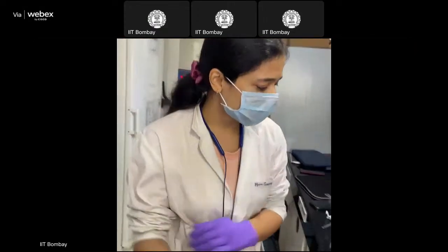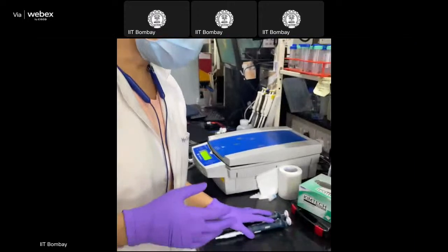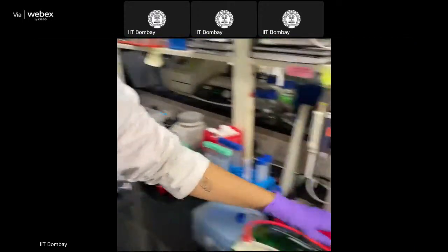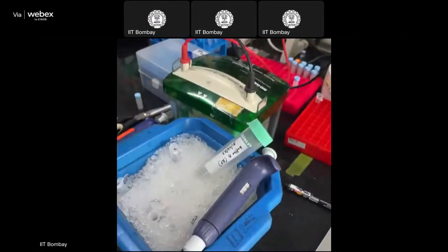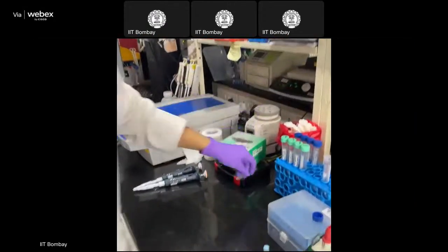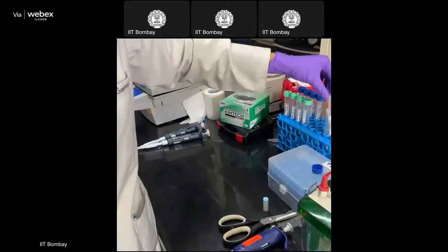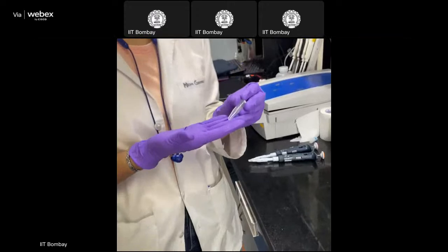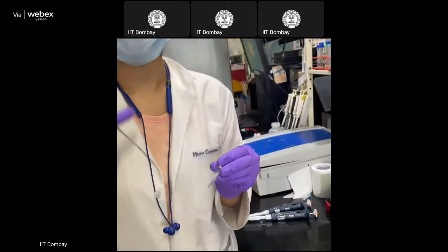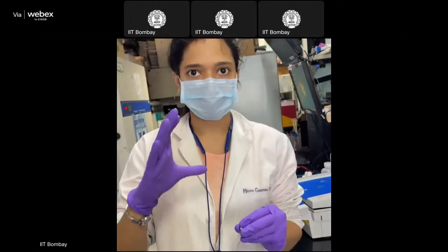Usually in our lab, we inject around 1 microgram of sample. So for that, we have this sample that was digested and desalted. After doing the desalting, we collected it in this tube. The elution is done in a very large volume.